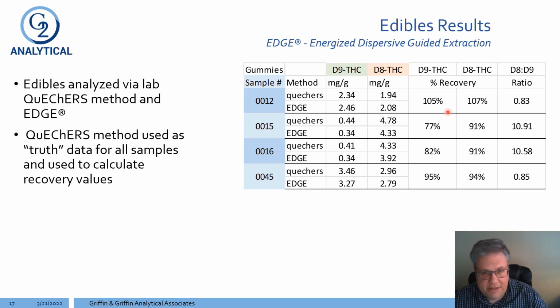So I think if we paid attention a little bit better to our particle size, we could even tighten this up even better. So better cryo grinding is what I see here. I mean, these are good results for our initial thing, but I think cryo grinding is going to make that even tighter.